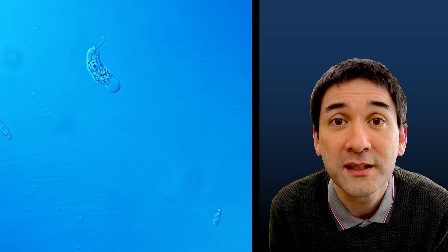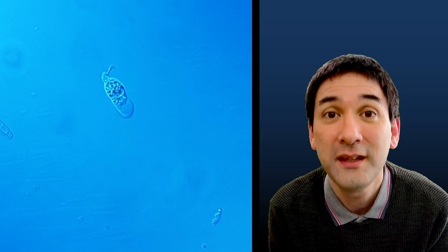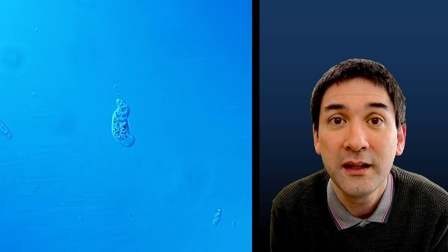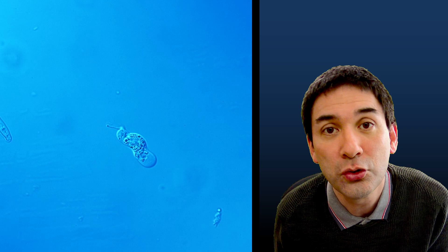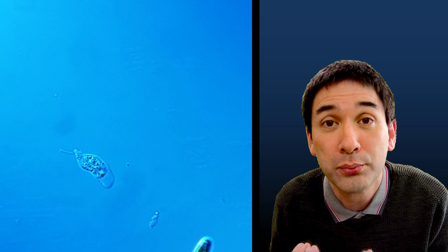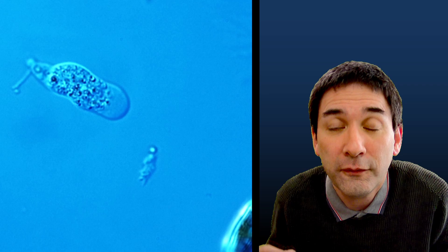This is an amoeba, not in time-lapse. This is now the real speed. And amoeba, a single-celled protozoa. And what they do is they are able to change their shape. And when they find some food, usually some debris, some fragments of cells or bacteria, then what they do is they engulf the food and then they digest it internally.